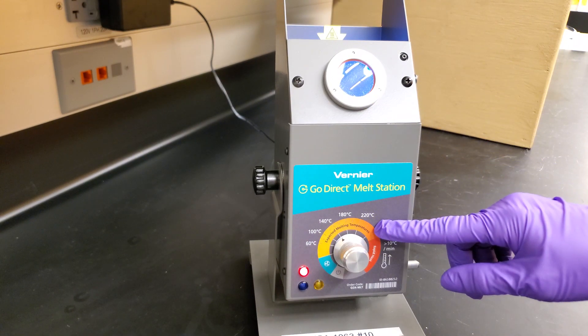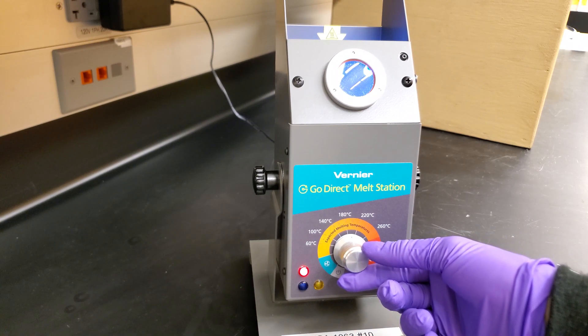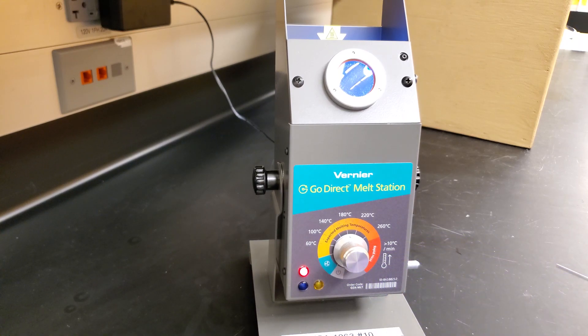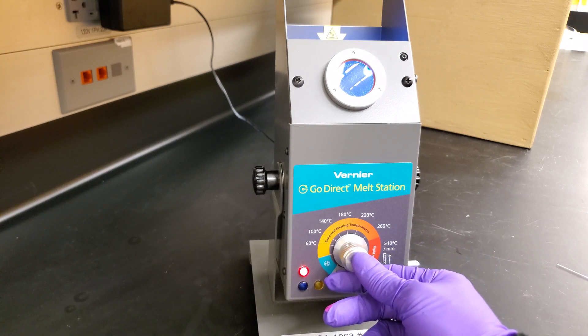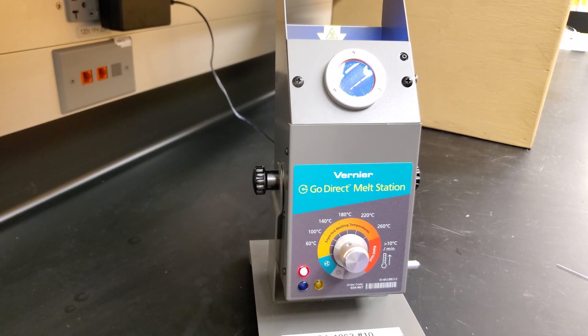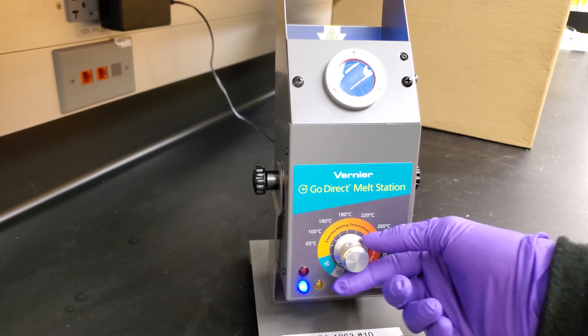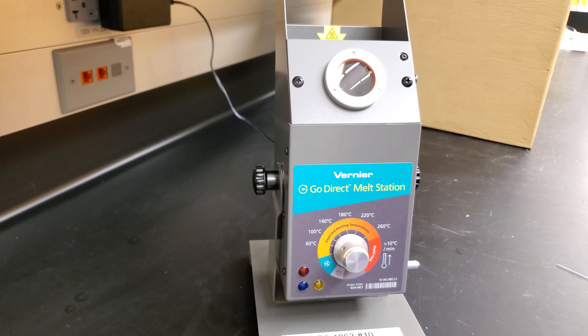If you know the range in which your substance melts, you can go right to that temperature or just above it. But if you're using the app and you want to find out what temperature something's melting at, you can go all the way to rapid heat for faster heating. Make sure to turn off the device when you're done using it and allow time for it to cool before putting it away.